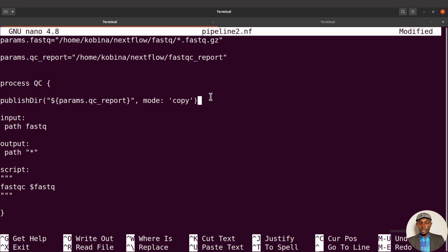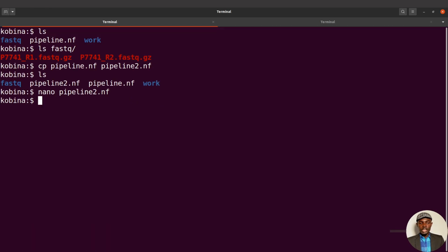So let's proceed. So now we have specified the directory. So that's all we need to specify here, nothing more. So we are done. Let's execute this command. So we will save changes. We will exit and save changes. And then we are going to run.